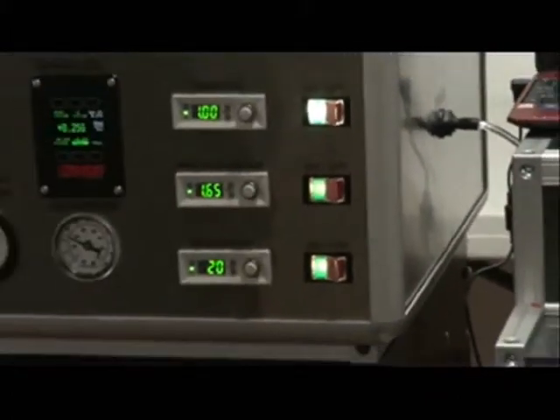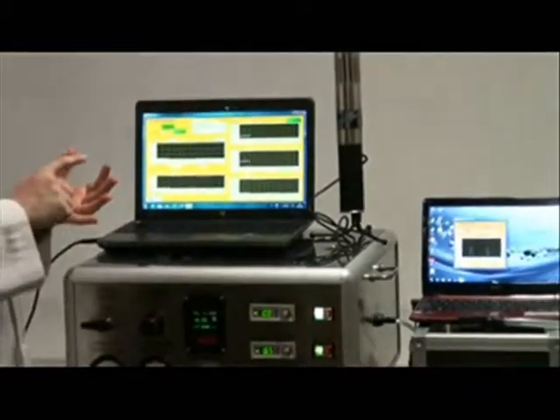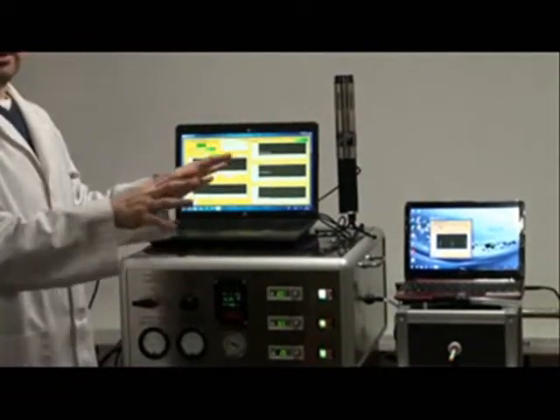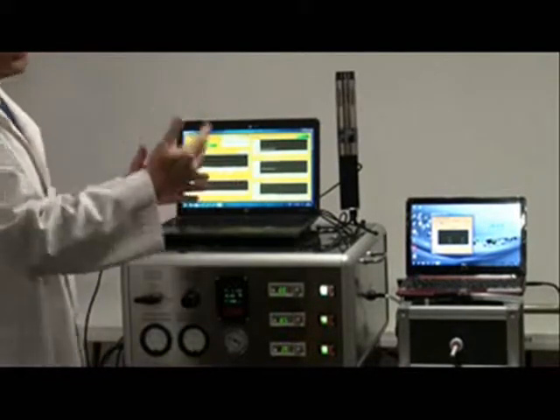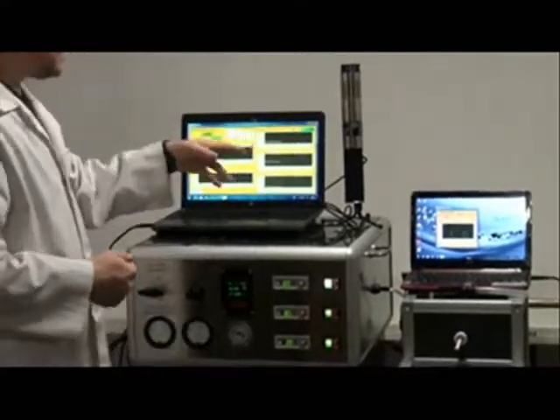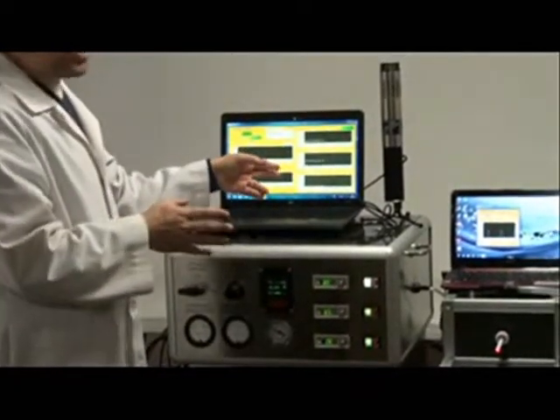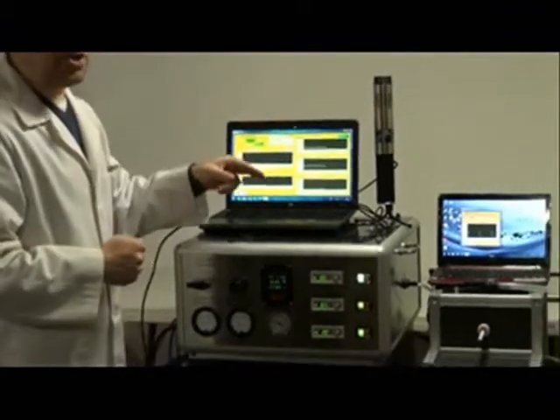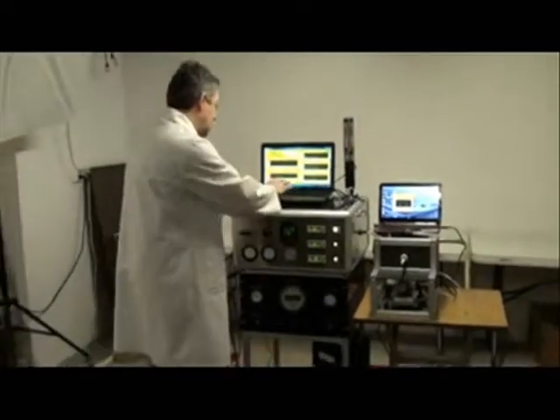We have connected with the software a gas monitor that measures CO, CO2, temperature, and relative humidity. In a real setting, this monitor will be inside the inhalation chamber or connected to it, so that this information about the CO and CO2, which is very important for in vivo exposures, as well as temperature and humidity in the cage, are integrated with the siphon.